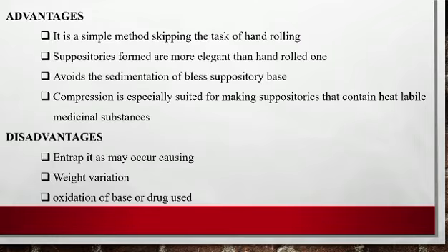Next, what are the advantages and disadvantages of this method? The advantage is that it is a simple method which skips the task of hand rolling. We do not need the pressure or skills needed for the hand rolling method.